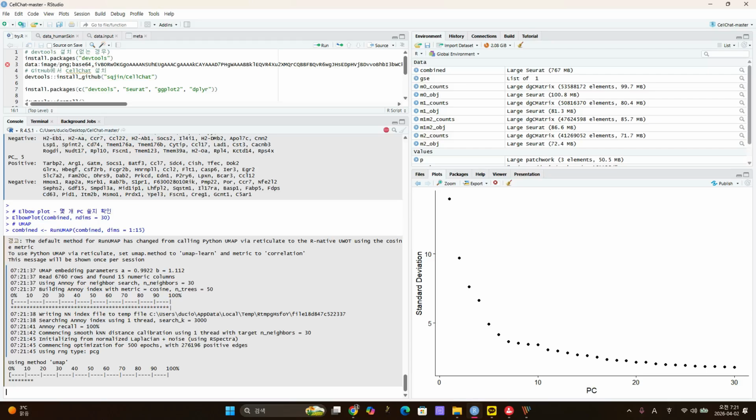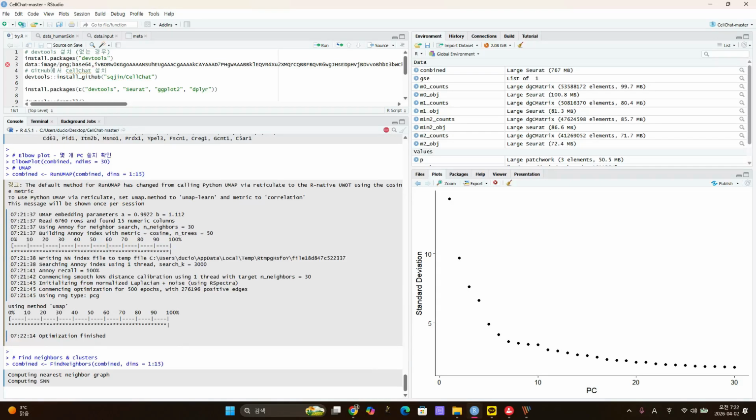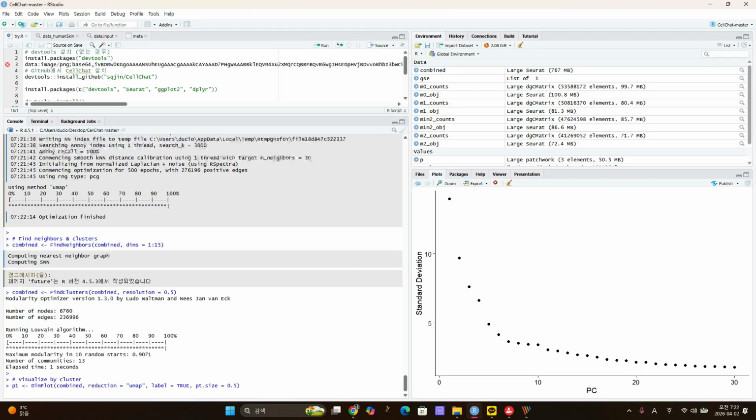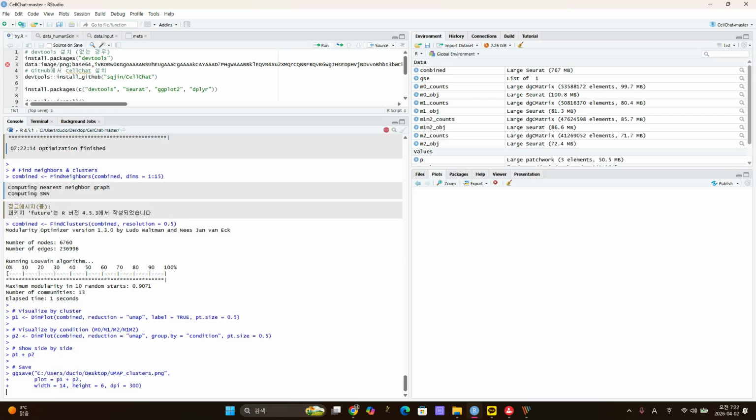You guys have followed me? Serious? Okay. Donghyun? Yujeong, is it going well? Follow along. You have to follow it. Just click. If you have some error, copy it and then ask.